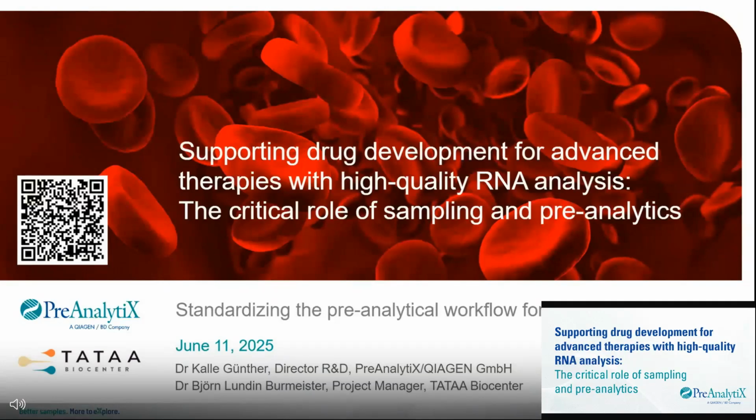Thank you very much for the introduction. I'm giving this presentation within my role as a developer of the Paxgene Blood RNA system and other products of PreAnalytiX. And today we will learn more about how standardization of the pre-analytical steps from blood specimen collection to isolation of RNA helps to get reliable and repeatable results from blood RNA analysis.